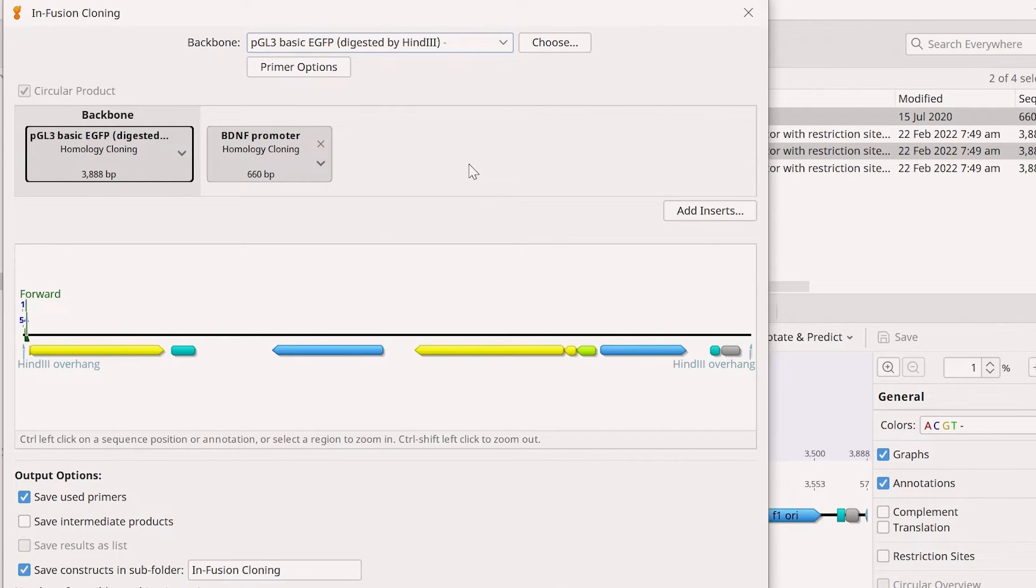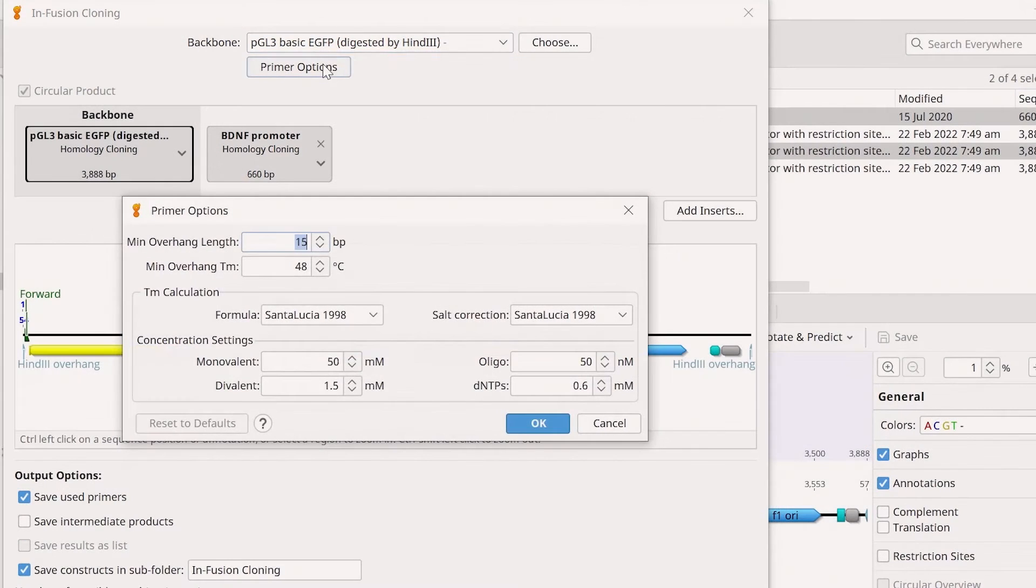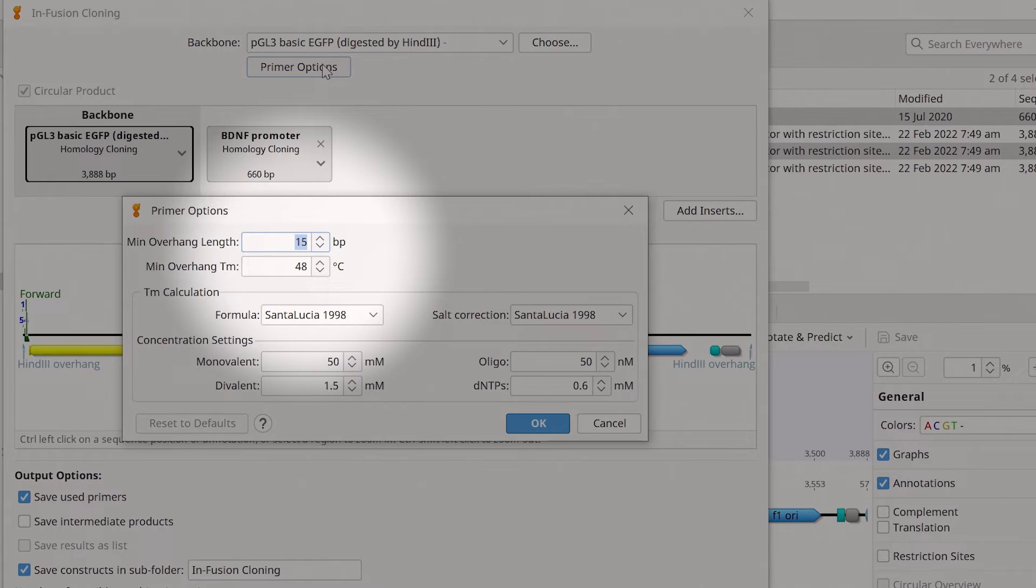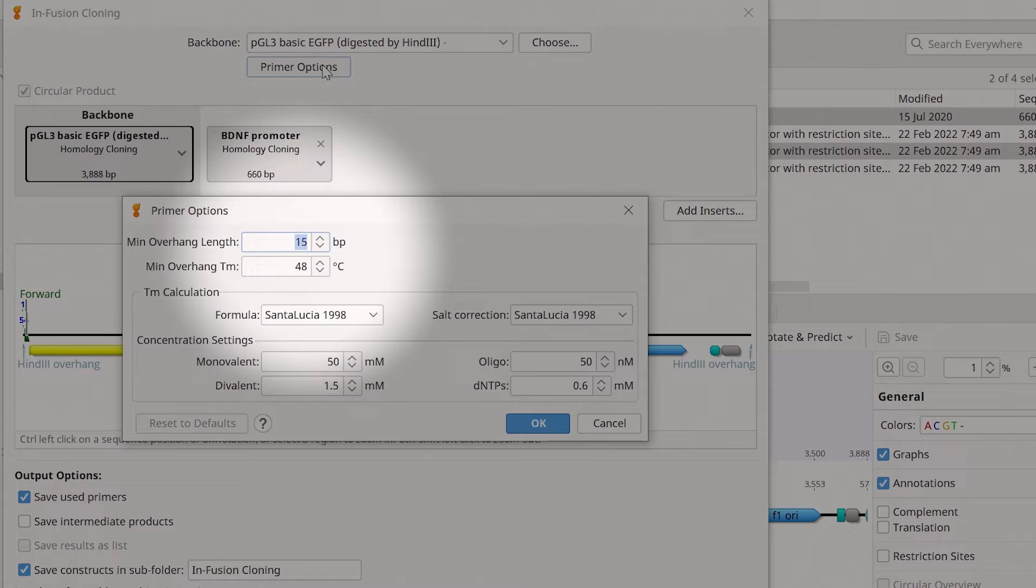By selecting Primer options, you can adjust the desired primer settings. By default, Genius sets the minimum overhang length, when using a single insert, to 15 base pairs, or 20 base pairs when using multiple inserts.